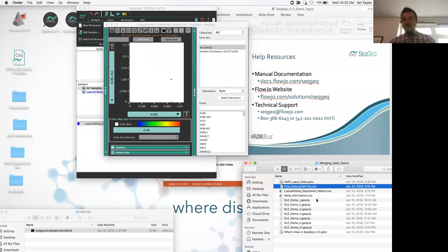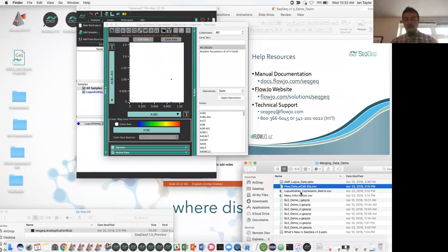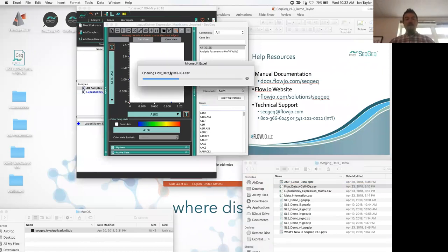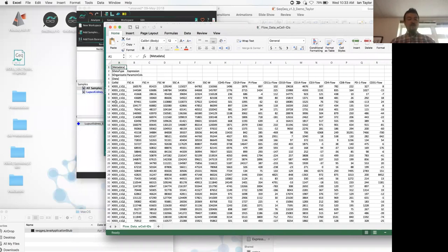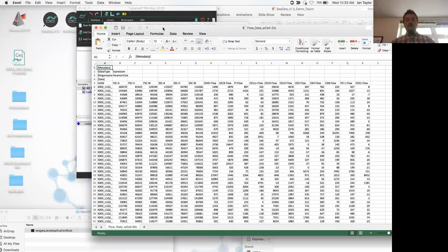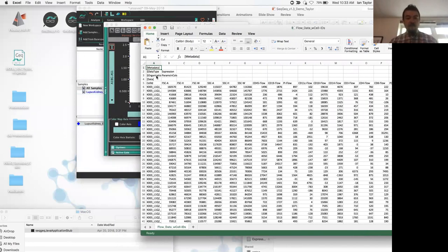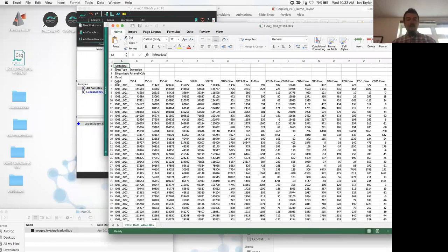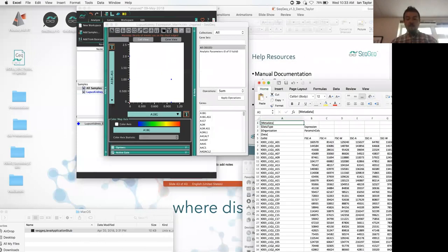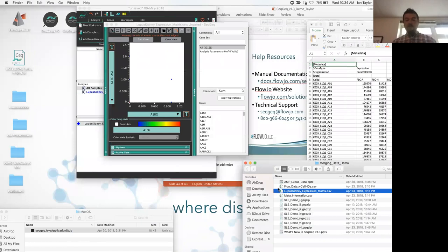This takes us to the flow data matrix with cell IDs. Opening it in Excel, we can see parameters in columns and different cells in rows. The important thing to note, aside from the flow parameters, is the cell ID column — these values must match the cell ID values contained within the lupus kidney expression matrix. SeatGeek has fancy sample inference to determine the correct matrix orientation, or we can specify that parameters are in columns using the organization metadata in the file.